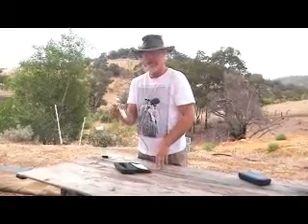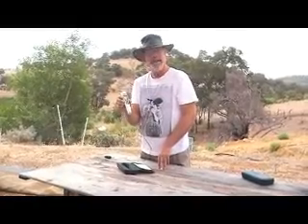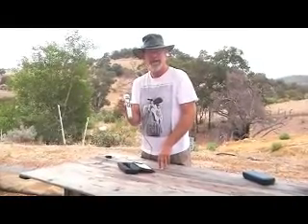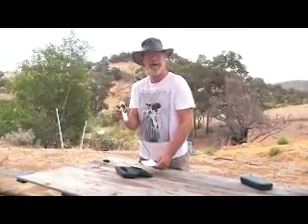So these are very, very good salt meters. We use them a lot for pools and spas, a lot of school use. So if you need a salt meter that's very accurate, it's not a toy. These are professional models, but they're at affordable prices. So go on our site, we are fantasticfarms.com.au, and you can have a look and get all the specs online.